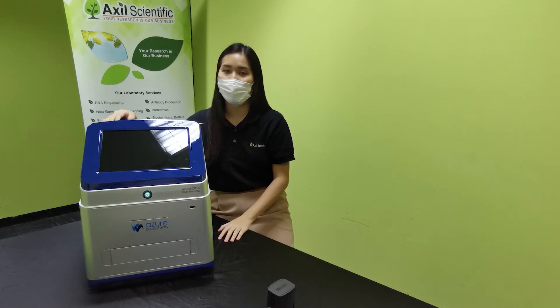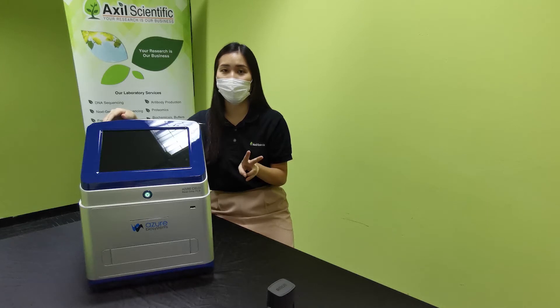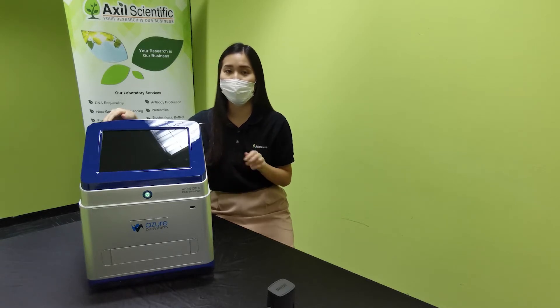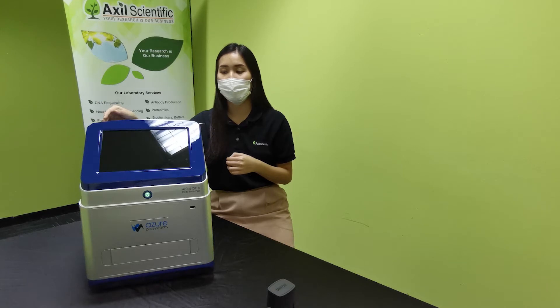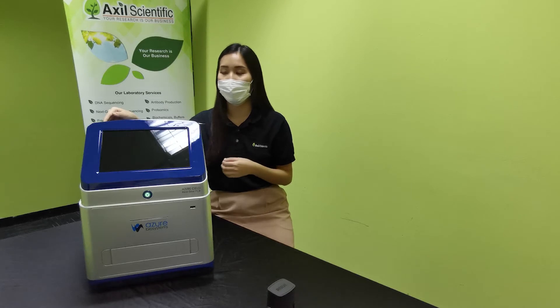Our system is designed for individual well scanning with 2 sets of 16 optic fibres, which means it will simultaneously scan 16 single wells with 2 sets of optic fibre for each well, using highly powered 6-channel specific LEDs for excitation and emission. This is to increase the sensitivity and accuracy for obtaining your results, since all the samples you are dealing with in qPCR are really important, requiring precision and accuracy in every run.